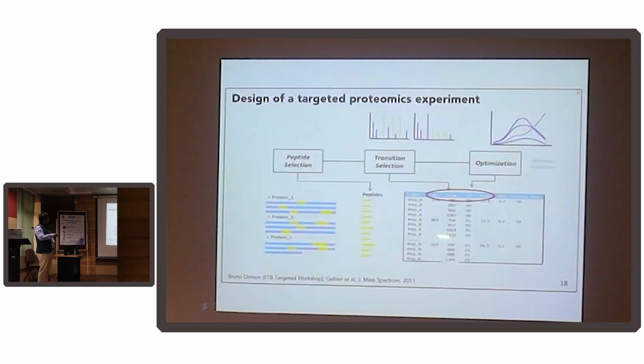And then you optimize what is the fragment, what is the retention time, and what kind of data you can generate for each of these specific peptides. So one protein can generate multiple peptides, and out of those multiple peptides, all you need for robust data is about 3 to 5 peptides. If you can analyze and make your assay very robust, you can take it to the clinics.